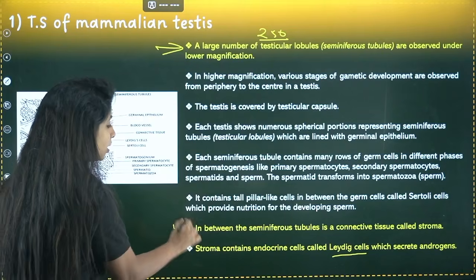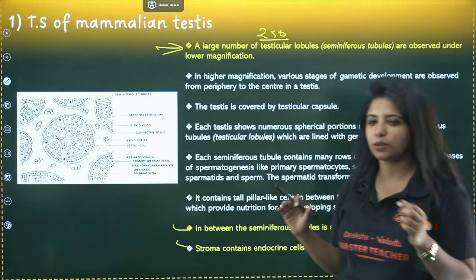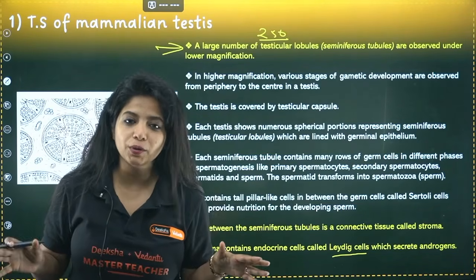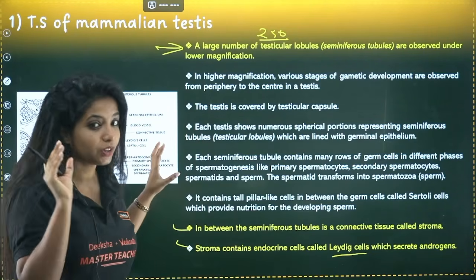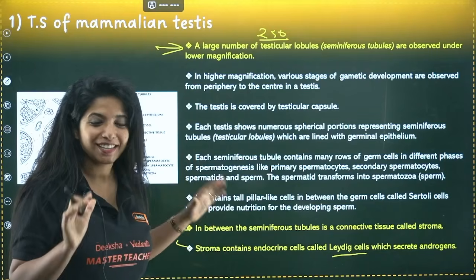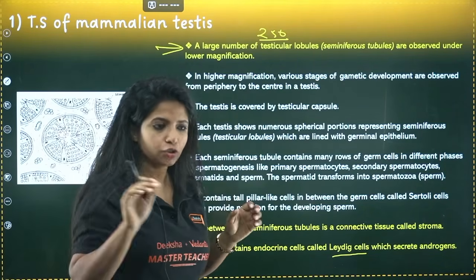Always remember, carry 2 to 3 points in your head, because if you forget 1 point, you can write more. But anyway, you are not going to forget. Why are you not going to forget? Because you are not mugging up. You are understanding the picture, and when you understand the picture, you do not forget anything. Okay, so this is spotting D.